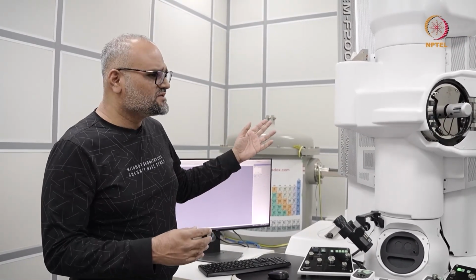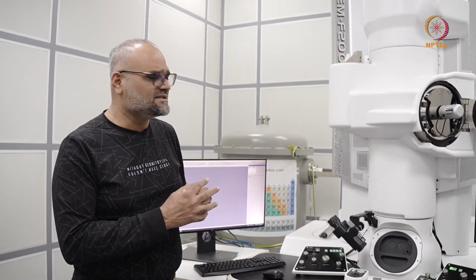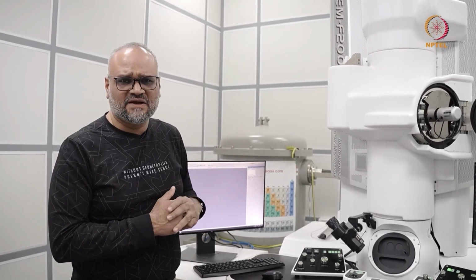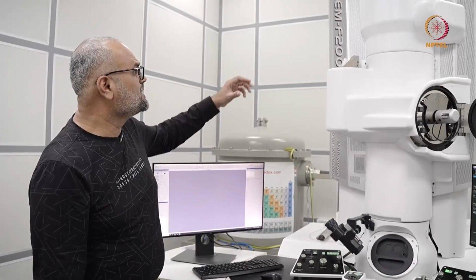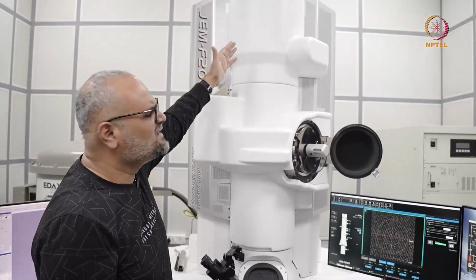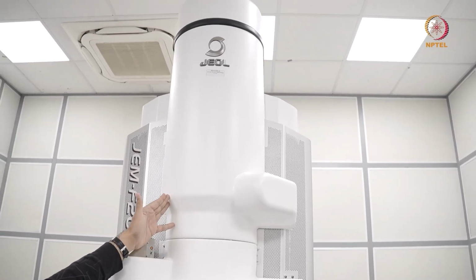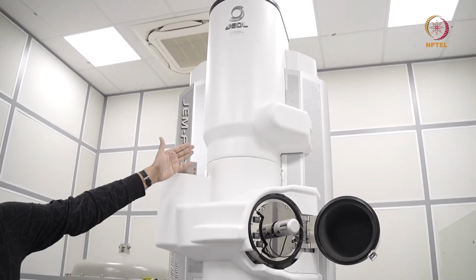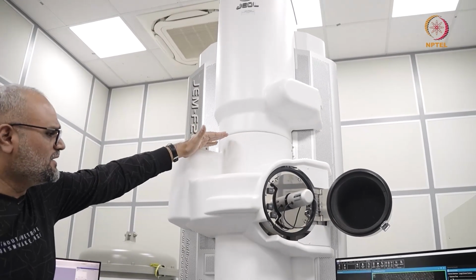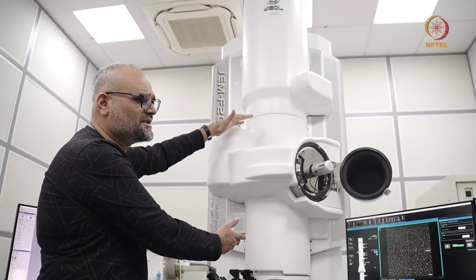And once the oil diffusion pump achieves a vacuum of something in the range of 10 to the minus 5 Pascal, you have 3 sputter ion pumps, or the other manufacturer, Thermo Fisher, calls them the ion getter pumps. So you have a 200-liter sputter ion pump which is connected to the gun chamber here. And in between the gun and the column, you have another 150-liter sputter ion pump. And on the column where the specimen area is, you have another 300-liter sputter ion pump.